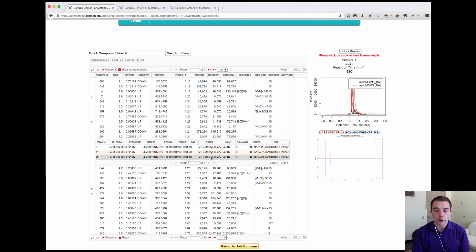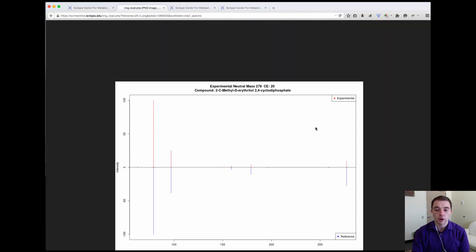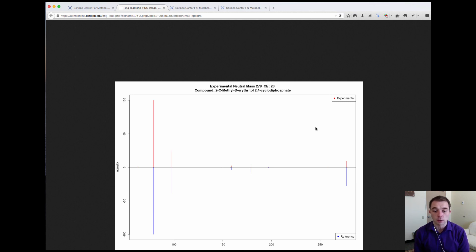If I click on any one of these, again I get this MSMS plot, and I can see that the best match was against this collision energy of 20. So if I click on this I can see that I get a very good match, and if I click on the image I get an enlarged image, and I can see that again this was a very good match.